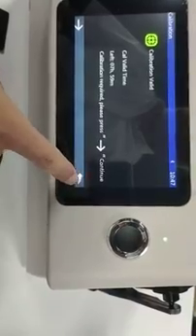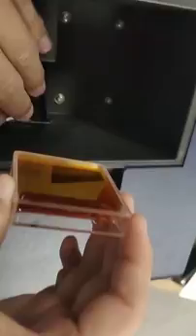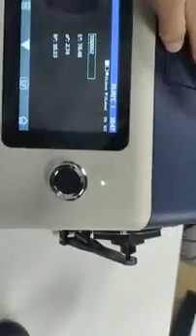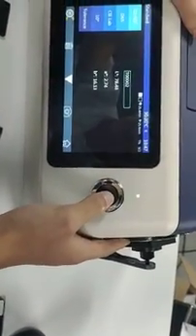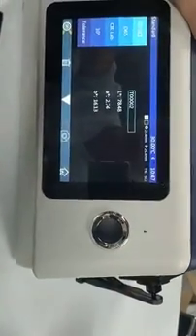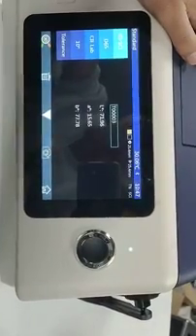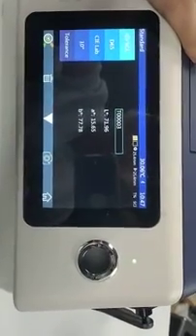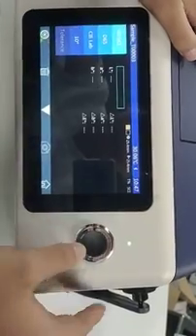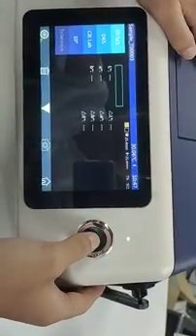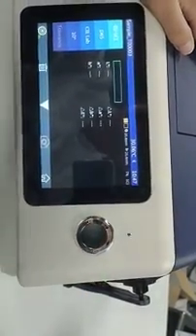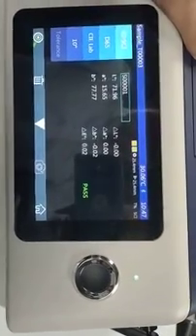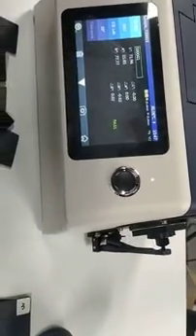And we go to the measurement interface to measure the transparent liquid. Put the sample here. Be careful with the liquid. Don't spill it out. Press a button. Ok. Ok. Measurement done.